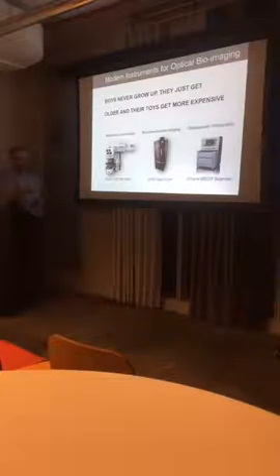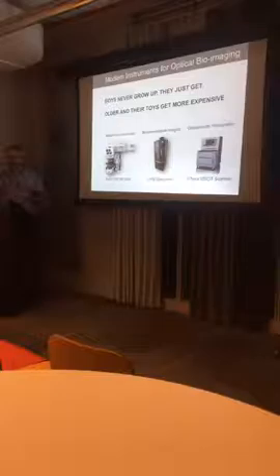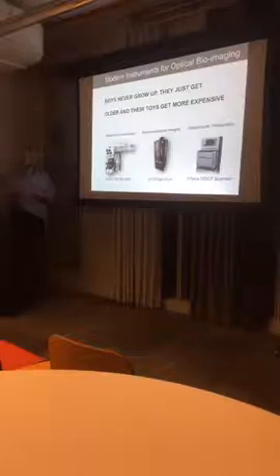With the system that I showed, you can put the whole animal inside and follow the bioluminescent image. You may be aware of the fluorescent proteins, yes? Most of them. Okay, we also use bioluminescent proteins. We can make genetically modified animals or different cells and tissue that will glow in the darkness. To make them glow, we inject luciferin, a substrate that will produce photons inside. So we can take a picture, and by taking a picture, we know where, for example, the tumor is.